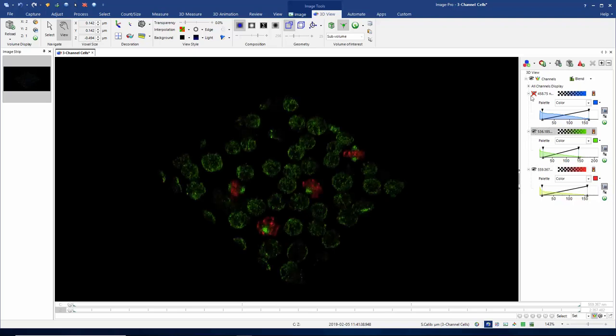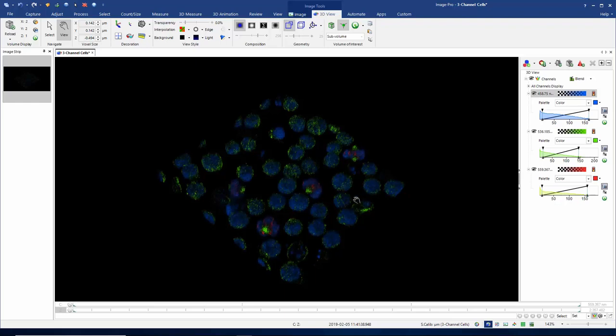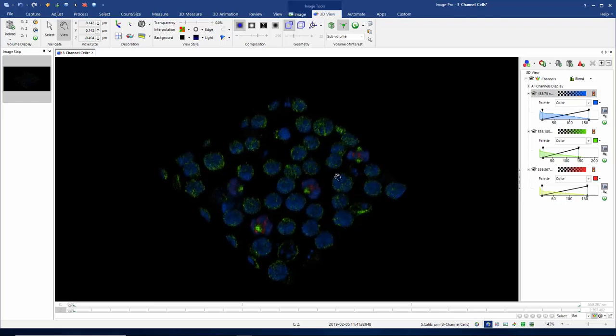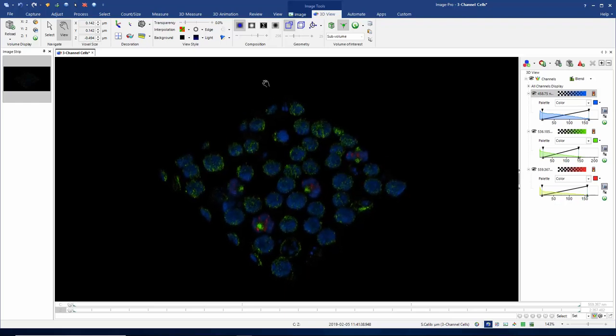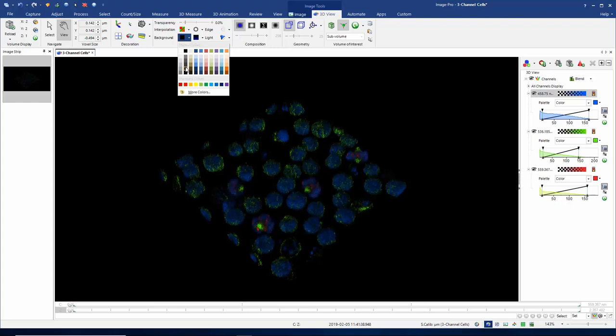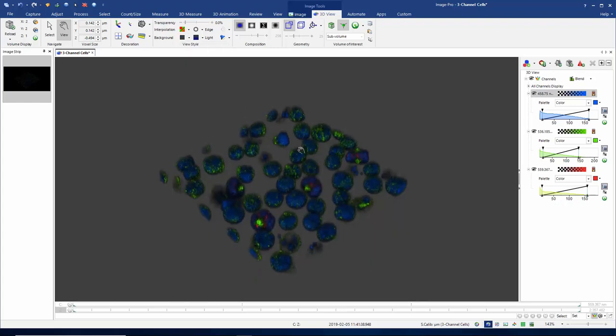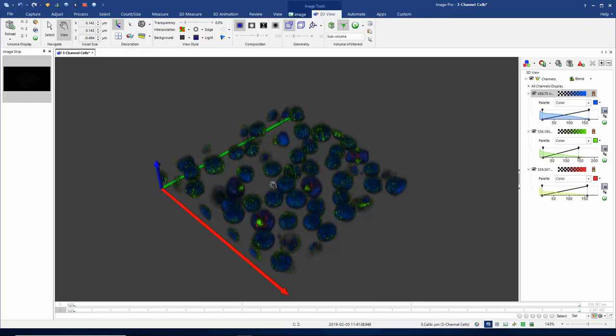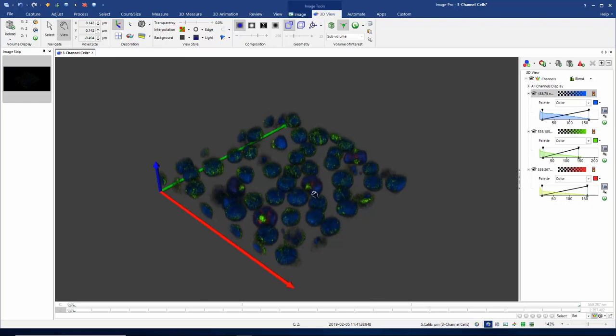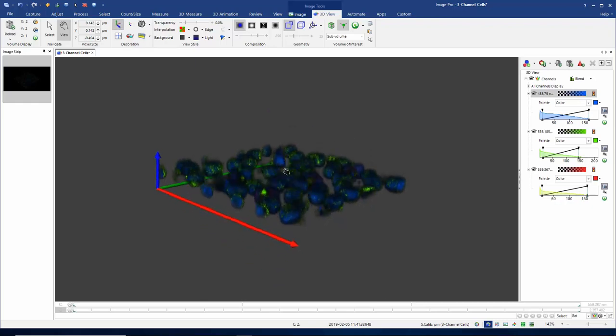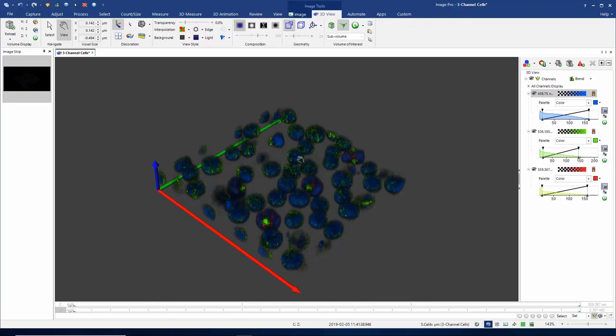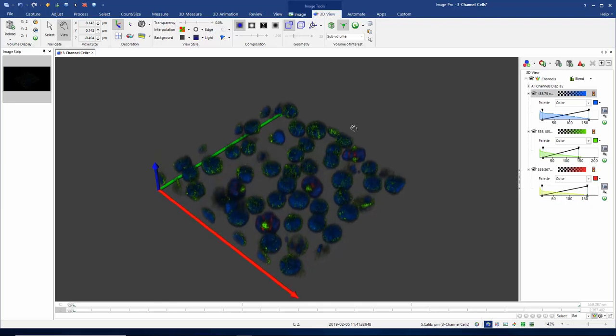Then we can show all three channels. You can see my volume is looking grey. I might also want to change the colour of my background, so I'll go for a slightly grey background here. And I'm going to show my volume axes to help me orientate myself in three dimensions.